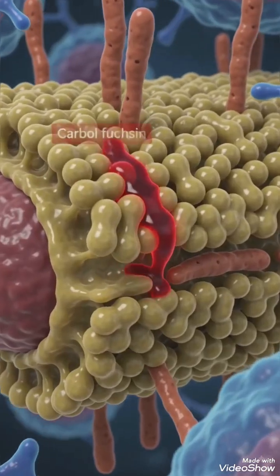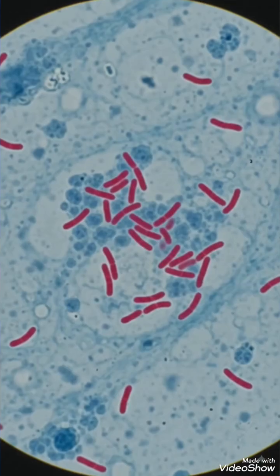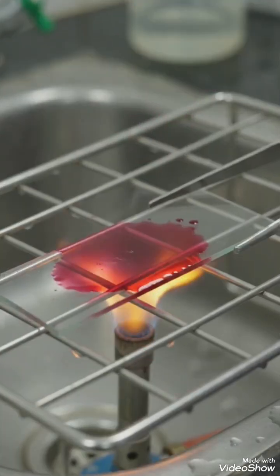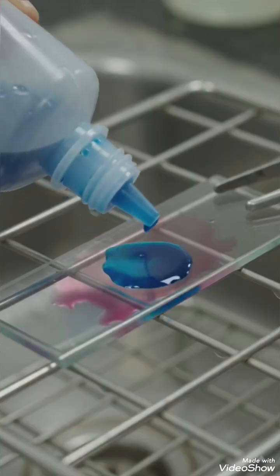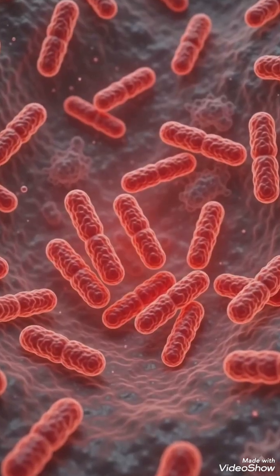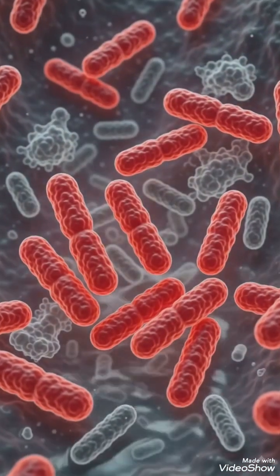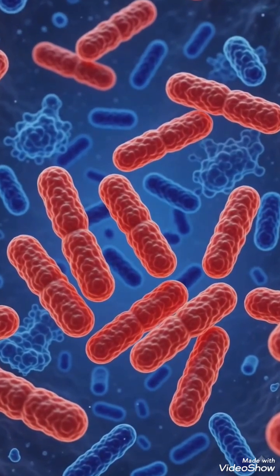Acid-fast staining differentiates bacteria possessing waxy mycolic acid in their cell wall. Carbolfuchsin, acid alcohol, and methylene blue are required. The methodology includes heat fix, flood with carbolfuchsin, heat gently for 5 minutes, wash and decolorize with acid alcohol, counterstain with methylene blue and observe under oil immersion. Mycolic acid-rich cell walls retain carbolfuchsin even after acid alcohol treatment. Hence, acid-fast bacteria remain red, while non-acid-fast bacteria become blue.